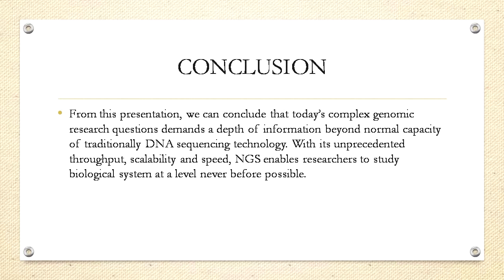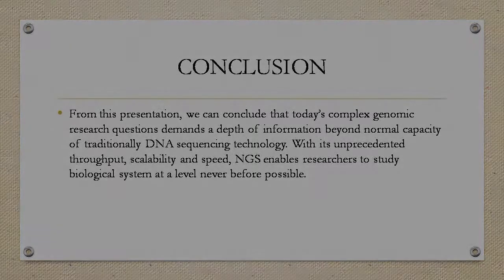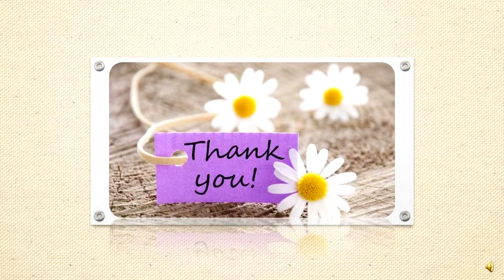information beyond the normal capacity of traditional DNA sequencing technology. With its unprecedented throughput, scalability, and speed, next-generation sequencing enables the researchers to study biological systems at a level never before possible. So that is the end of our presentation.